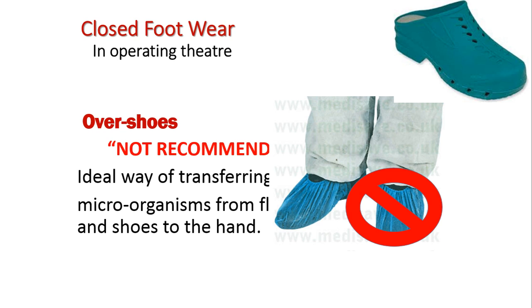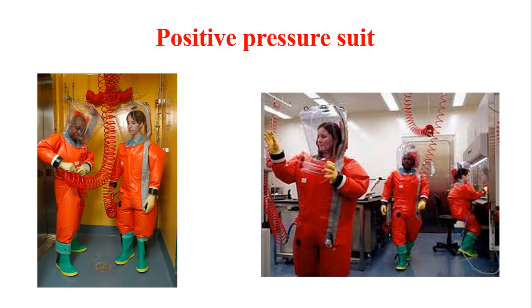Usually that too, particularly when we are on field jobs, field duties, as you might have seen various technicians roaming into the public settings to collect the samples from the people. You might have seen they are wearing shoe covers. So for outdoor jobs or for field jobs, even shoe covers can also be used. However, for laboratory work, shoe covers are not recommended.